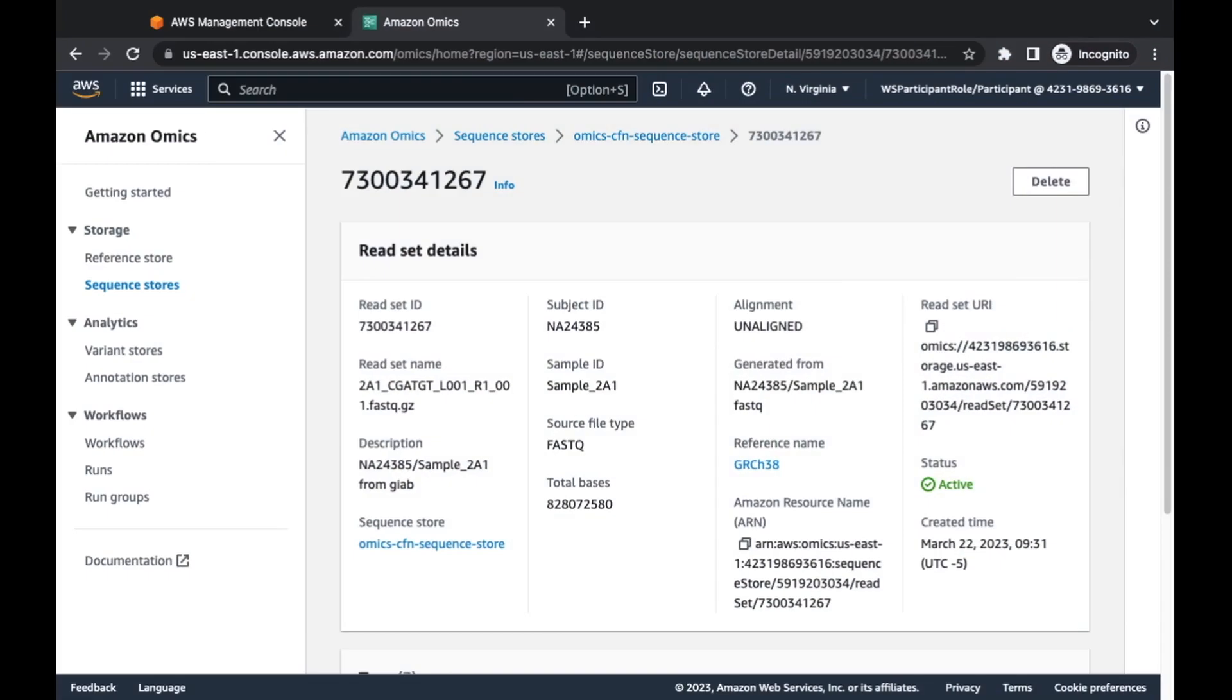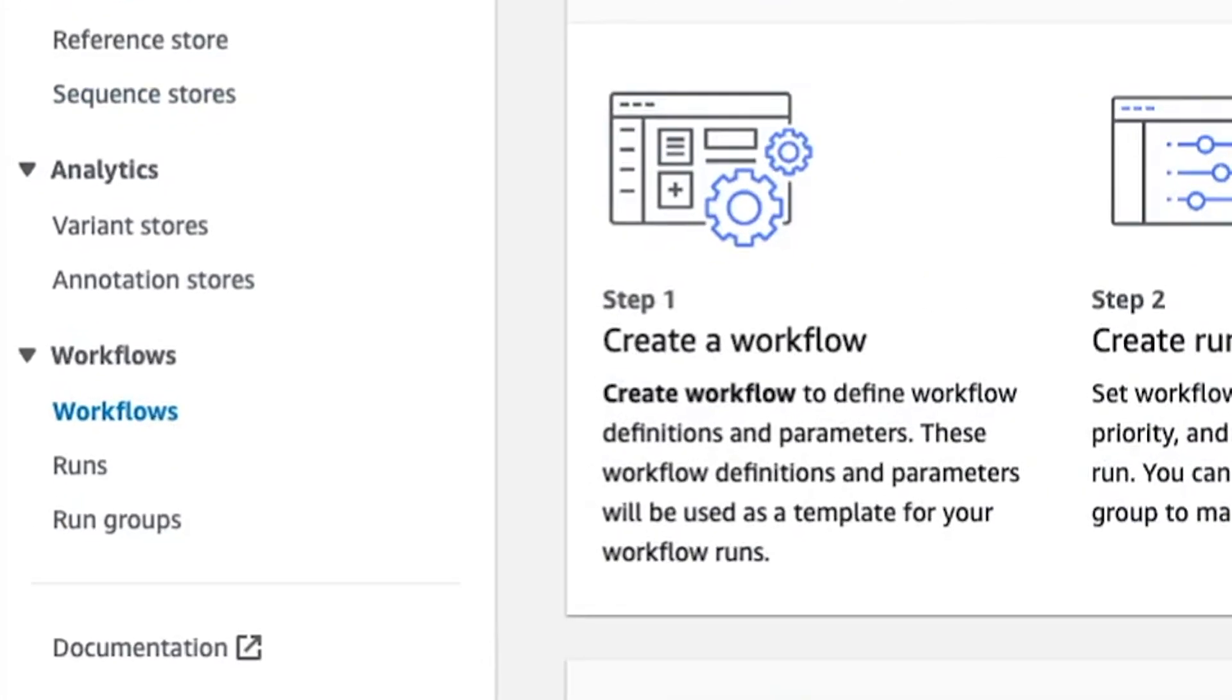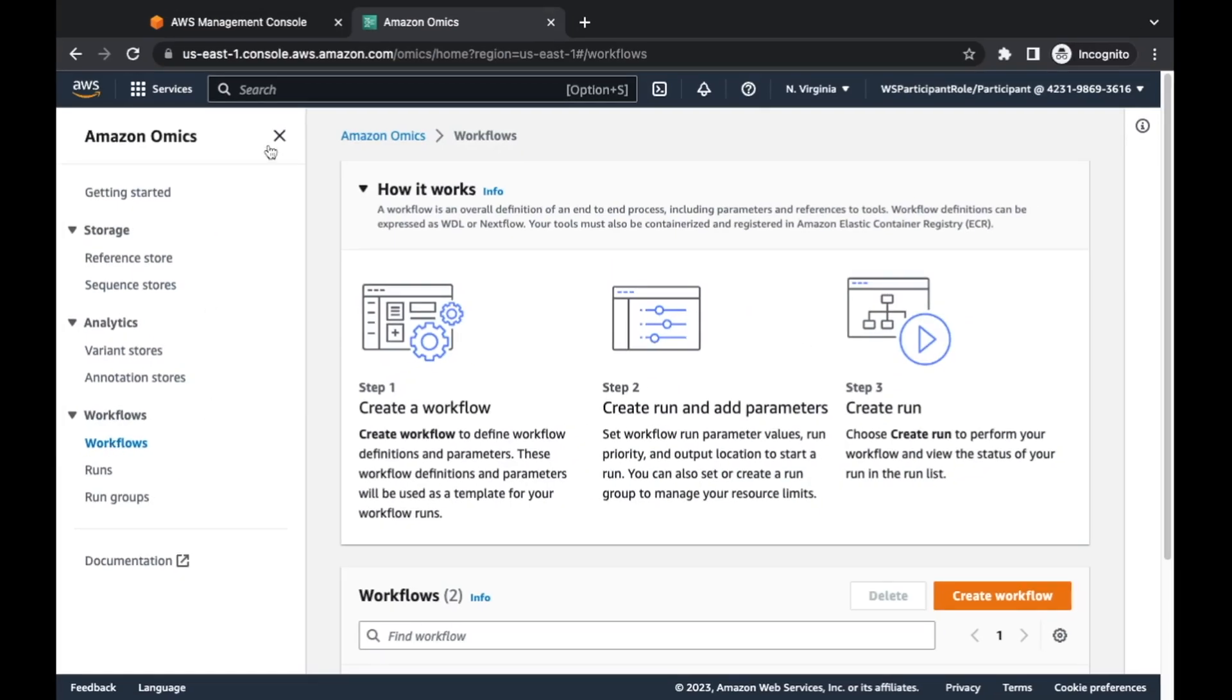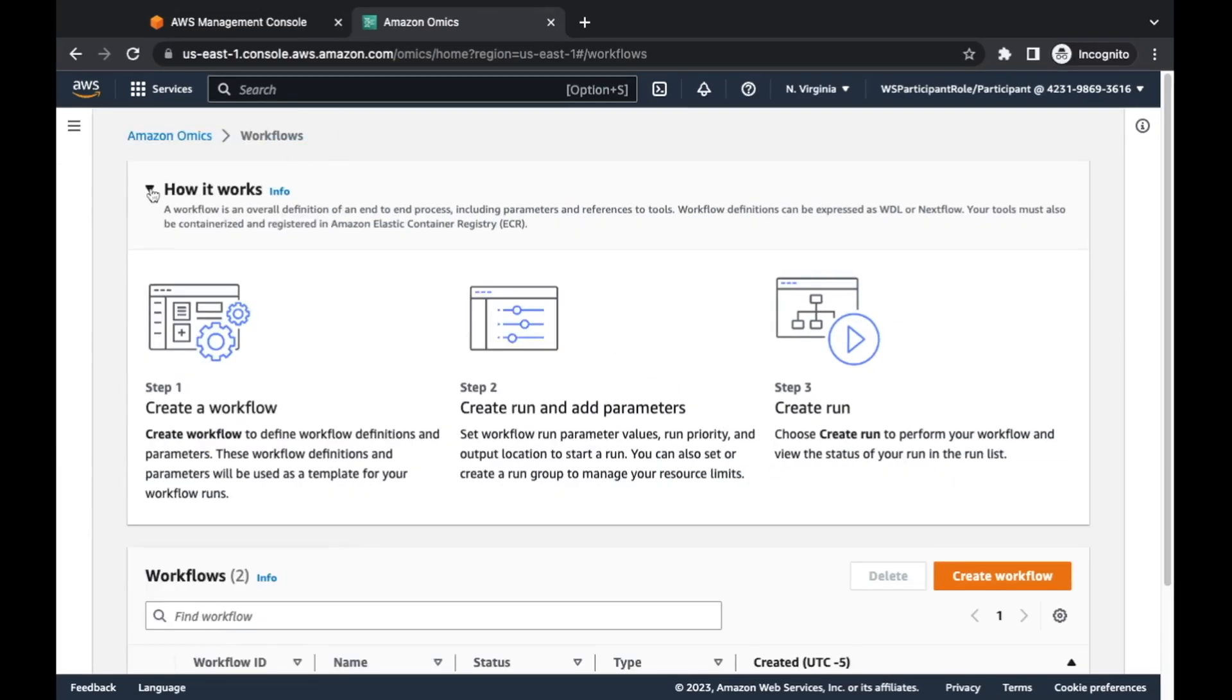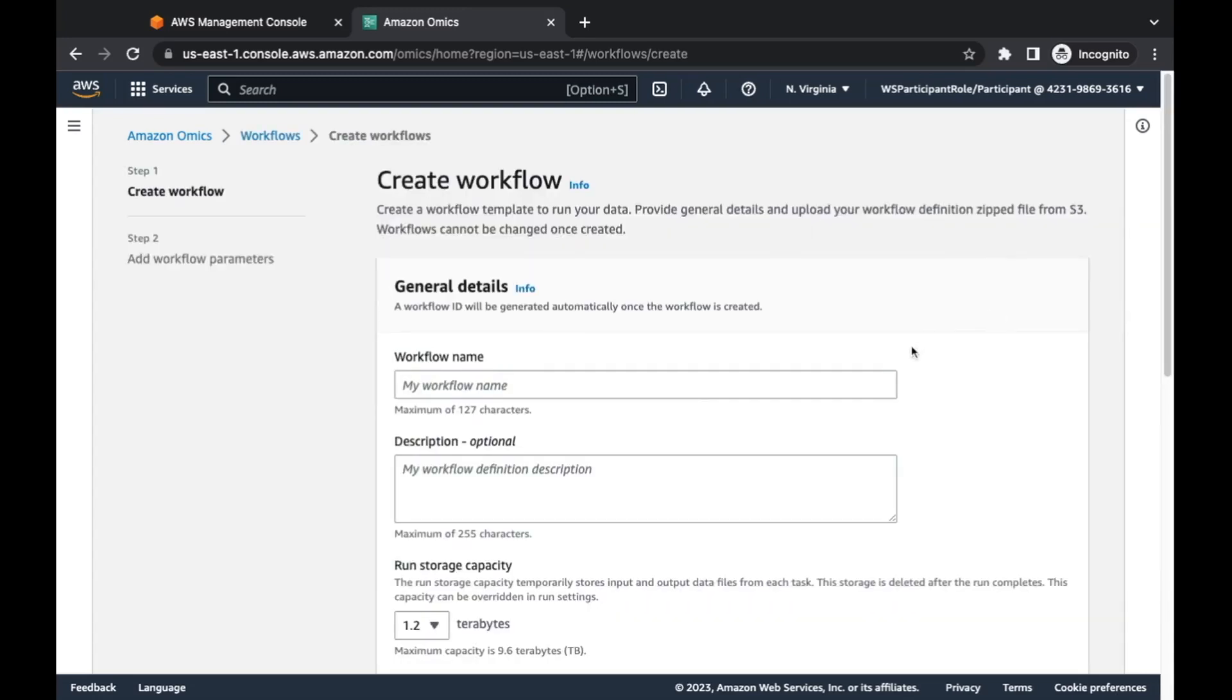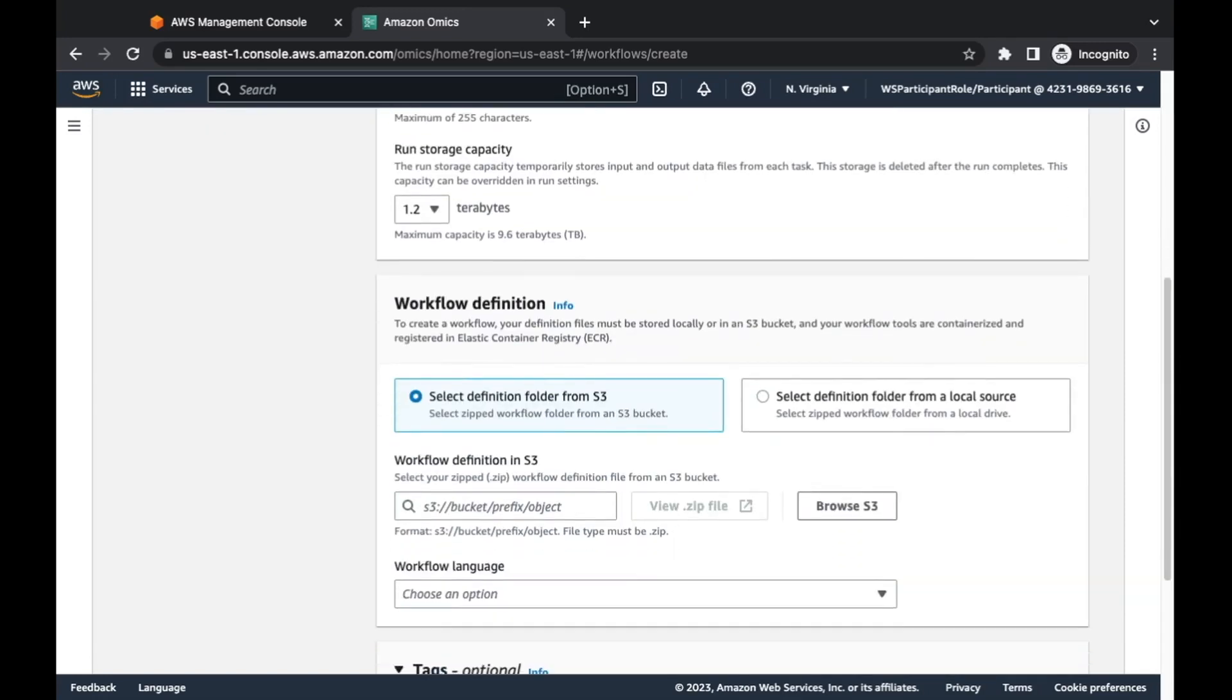One thing I want to show you is if we go back to our sequence store, any imports that you bring into a sequence store have a unique ID that's important for cases where you need immutable data sources, so cases where you need to track provenance of where your information came from. We can see all of the information associated with it, all the metadata that we provided on imports. We have this read set URI here. This is how you would refer to this particular read set data in any downstream analysis.